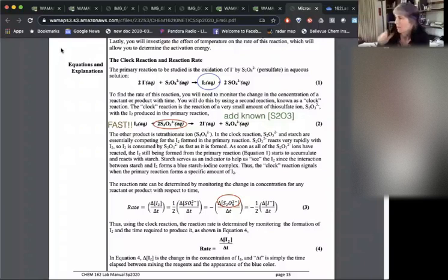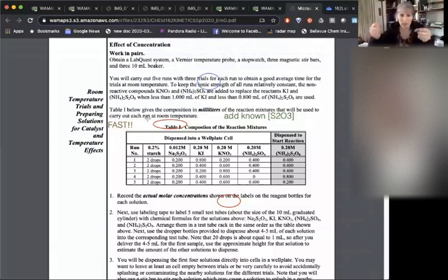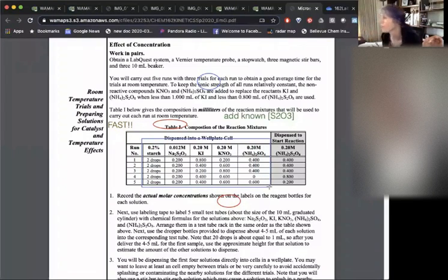We do the first step, right? The first reaction, and then we add the thiosulfate. We're going to start with 2 different containers, and one is going to have all of our stuff to do both reactions. So we put them all together.